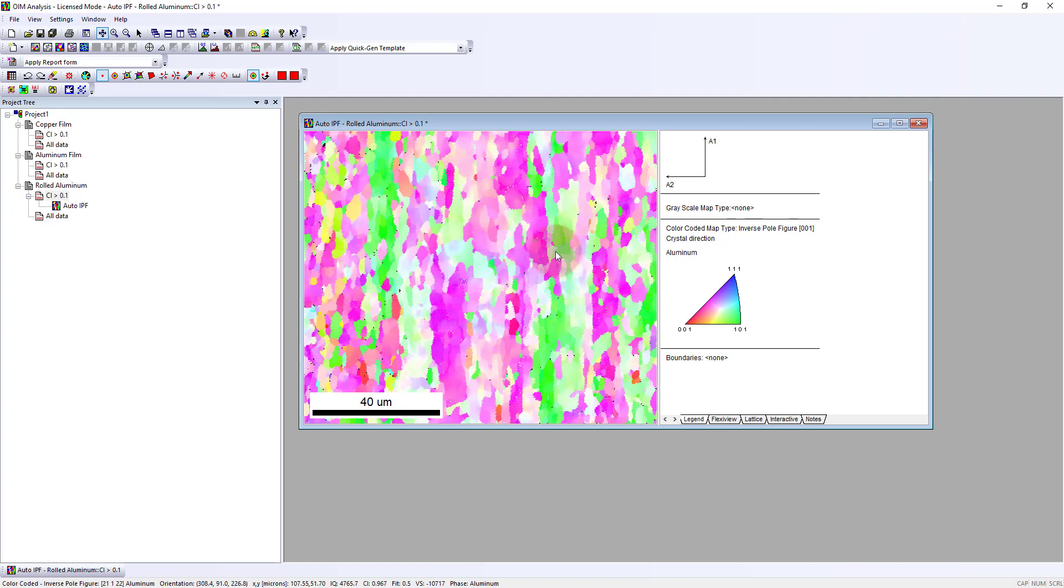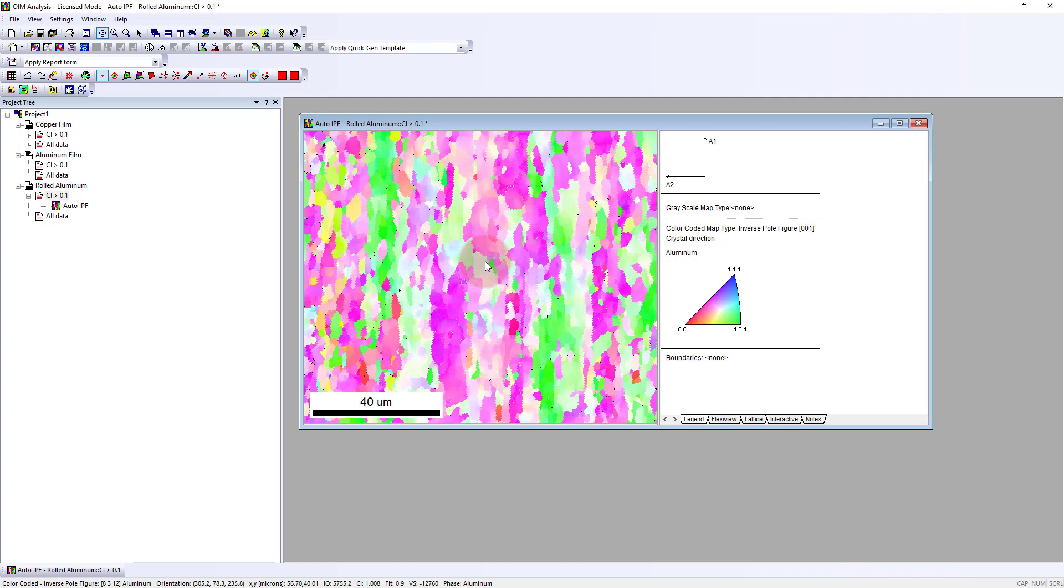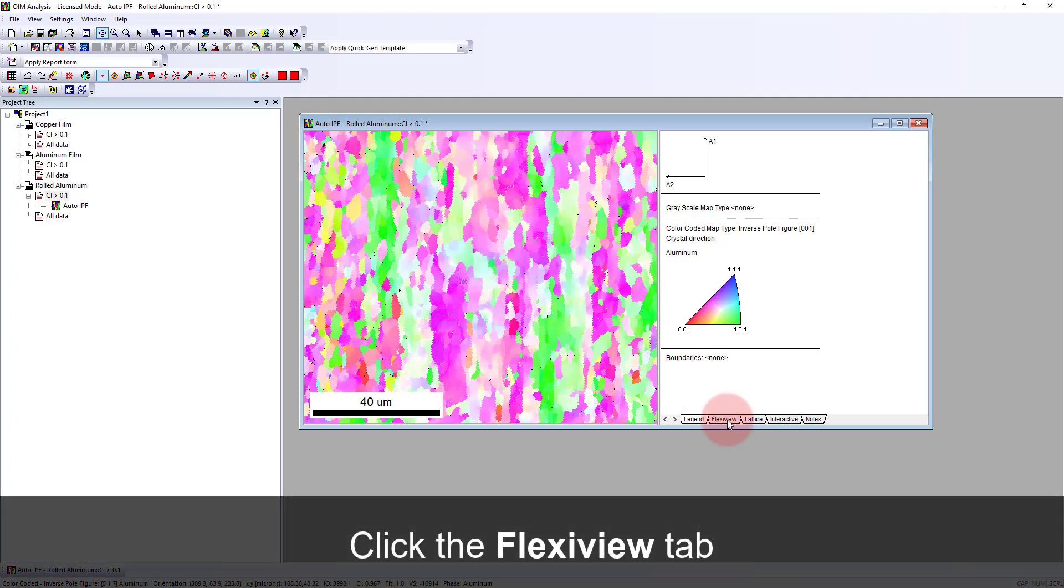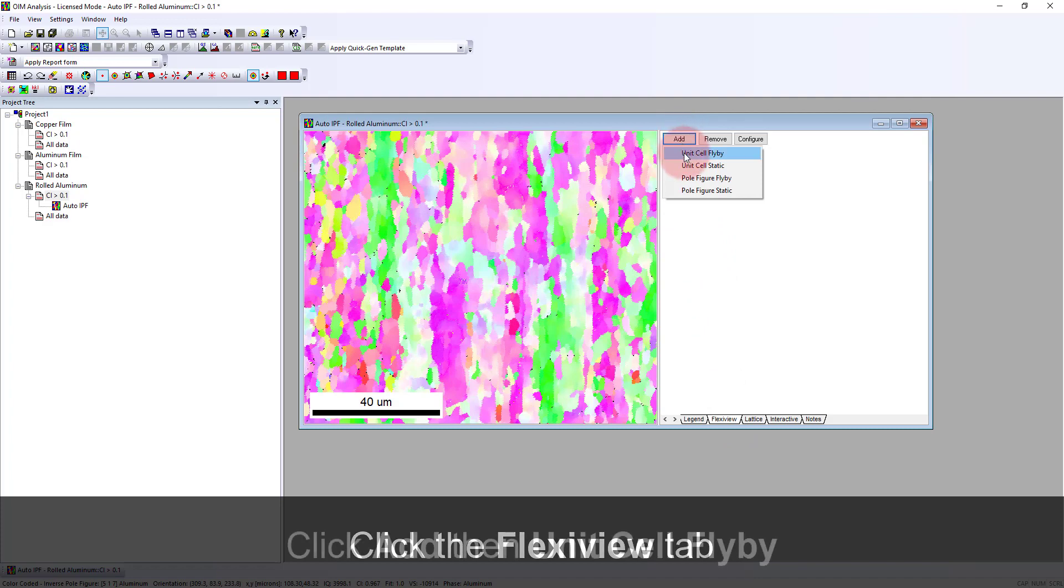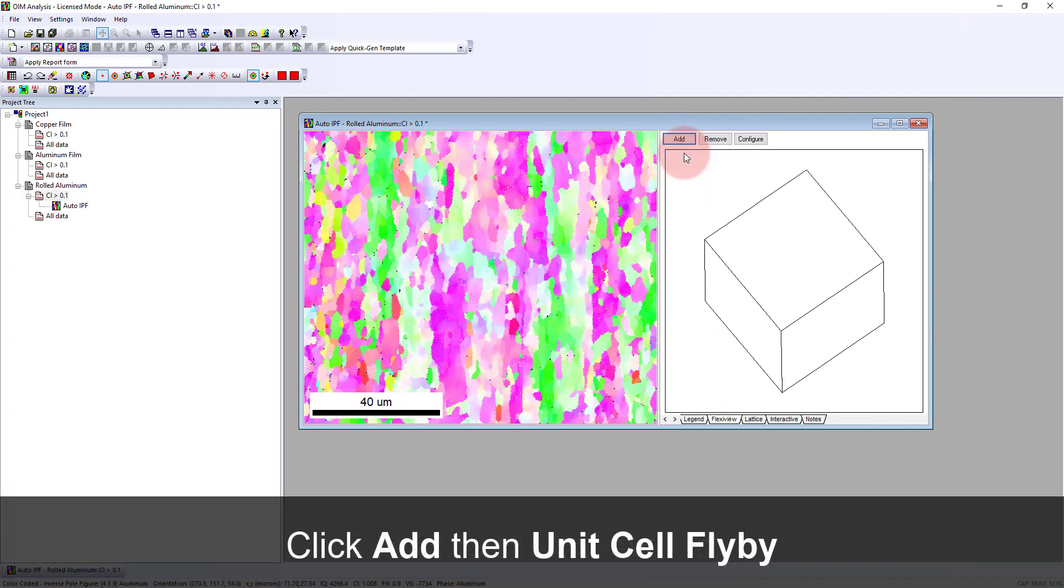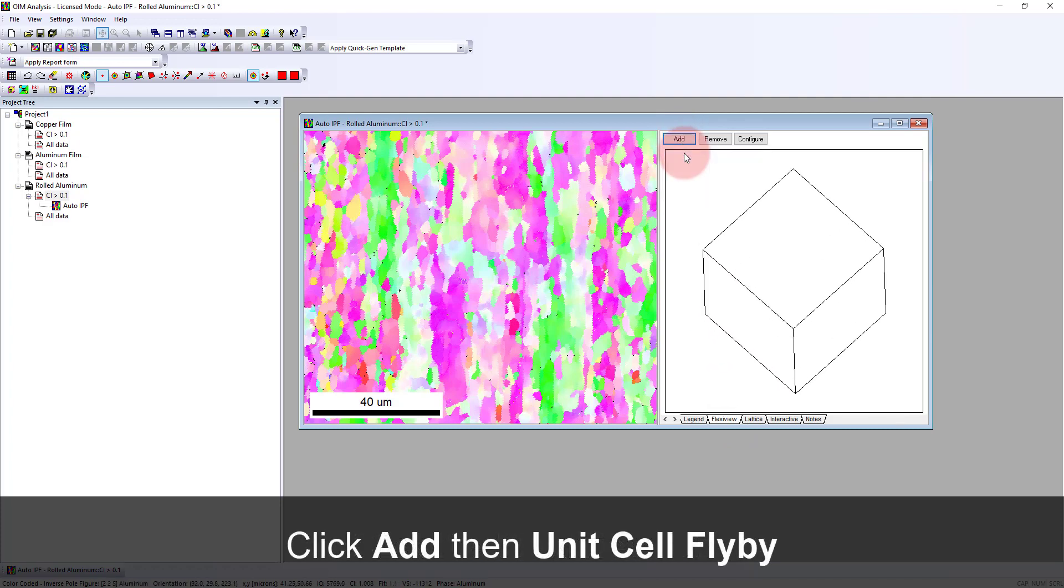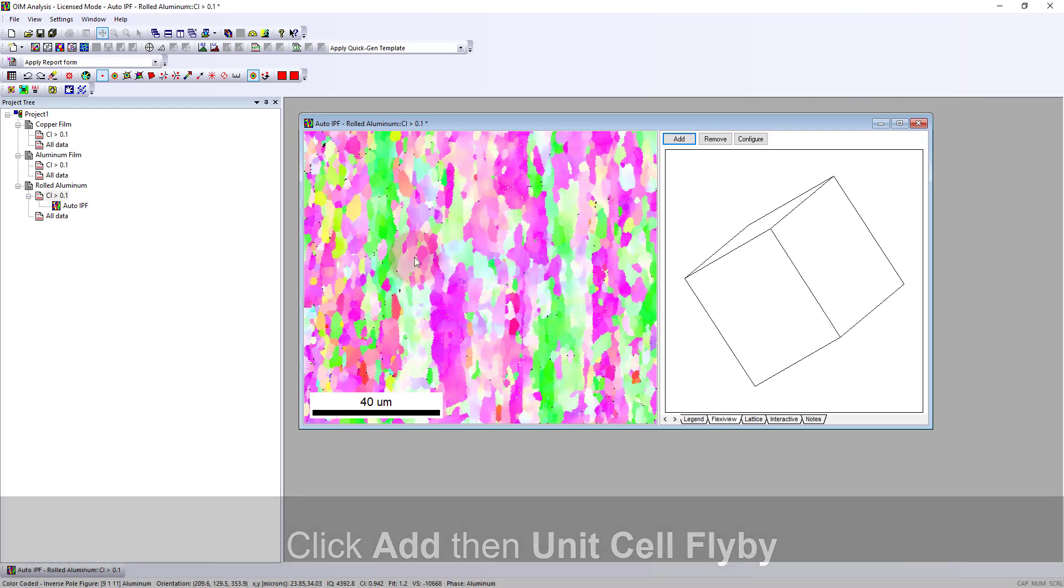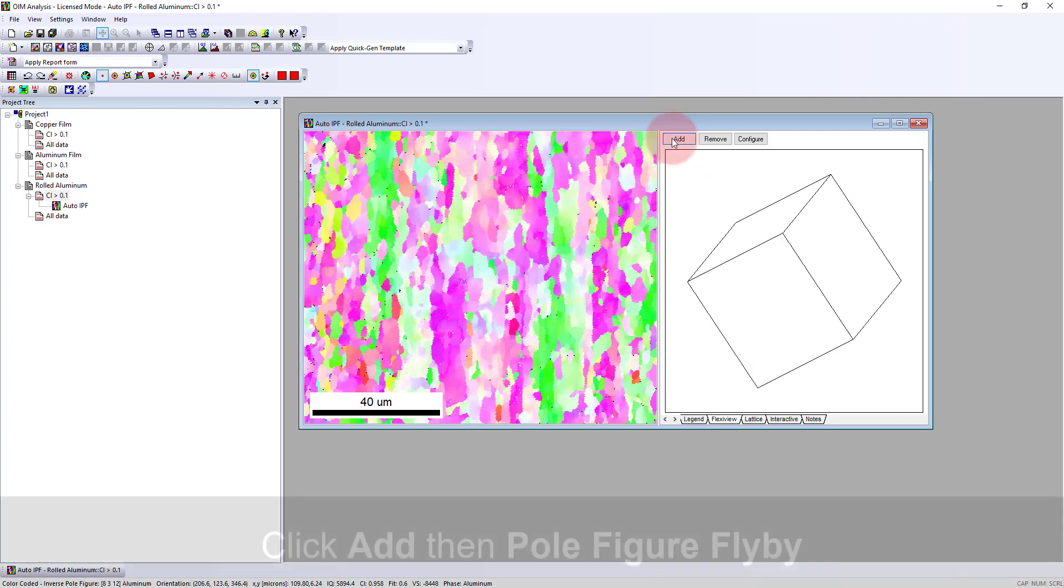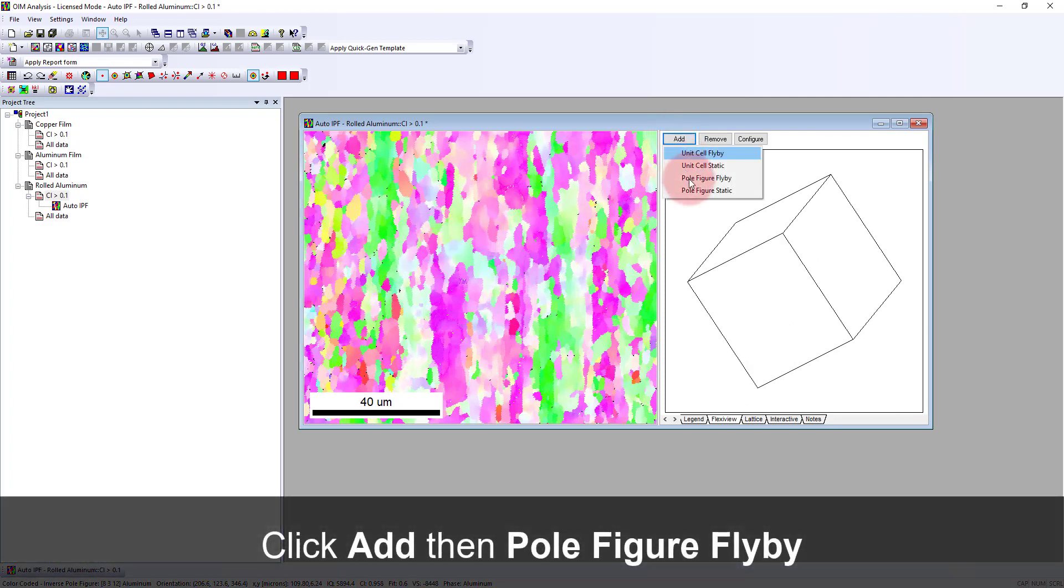Now I can visualize this using our flexi view option and add a unit cell. So as I move my cursor to different grains, I see how the orientation changes. I can add a second flexi view panel looking at the pole figure.